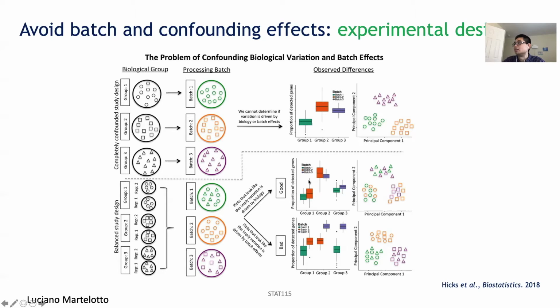So for example, after you obtain the data and do a PCA, you know this is good because the same kind of samples cluster together, even though they're from different batches. For single cell studies, now one can do multiplex and barcode different samples and then run them together within a single 10x controller, and that can help to mitigate this batch effect.